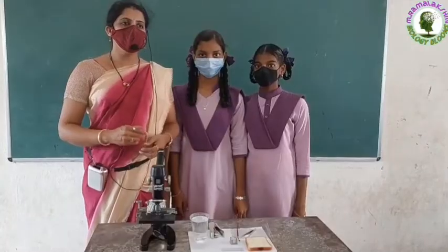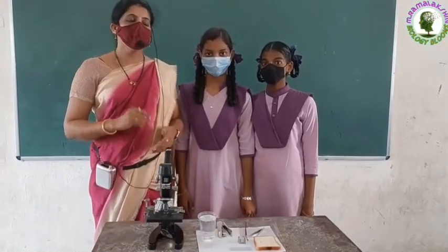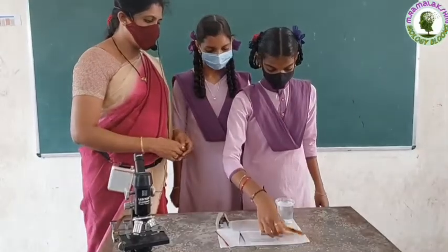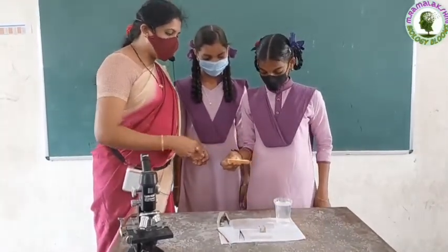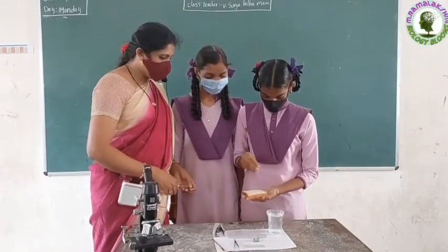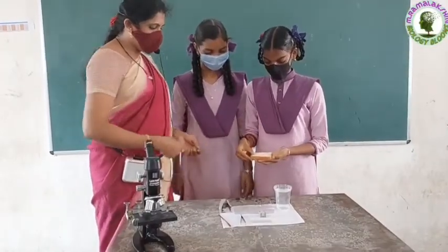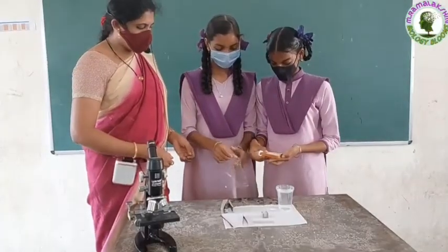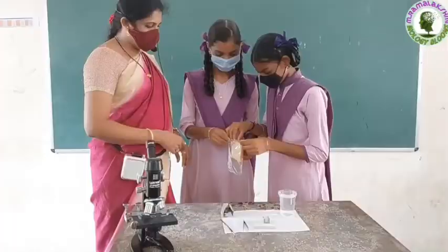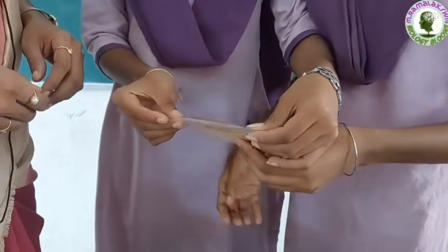First, we have to grow the bread mold. For this, Harika, take the bread. Now sprinkle some water on it. Nohita, take the cover. Harika, put this bread into this cover. Now fold it and staple it.